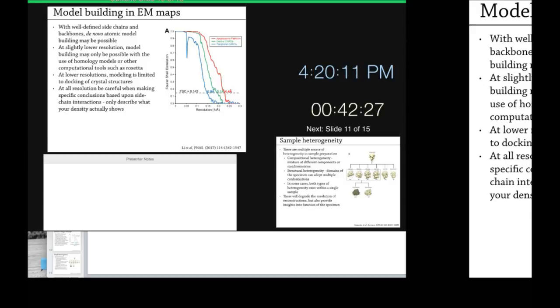How often have you seen ordered water in your channel structures? I haven't seen it. None that I would believe, but I haven't gotten beyond about 3.4 angstroms. So again, is the issue with the ligand because some particles aren't capable of binding ligand, or is it because the affinity was so low that at the experimental conditions you don't have full occupancy of that molecule? Could be a mix of those two. Even a lot of times with saturating ligand, you don't necessarily have 100% occupancy because you're always at equilibrium. The more ligand you have, you're going to shift it further and further, and you may drive it nearly to completion. But some things don't get driven to completion. Other times, ligands will bind but not necessarily generate the conformational change, because that's also an equilibrium interaction. So there's multiple equilibria that you have to sum together to get things that are in conformation plus the ligand bound. Okay.